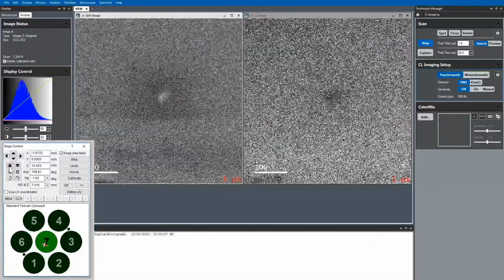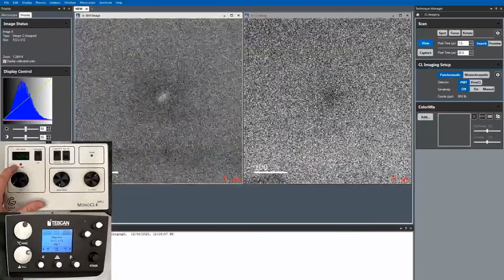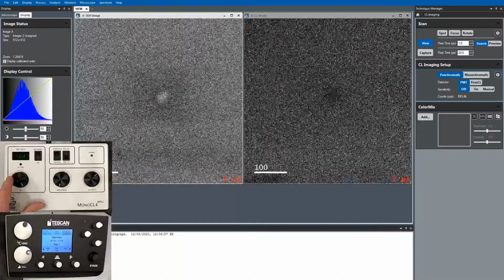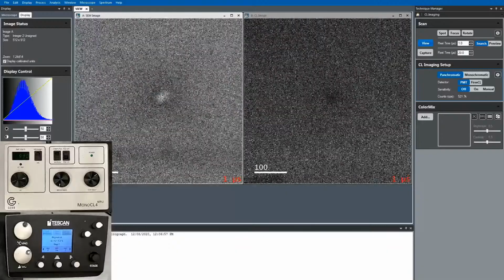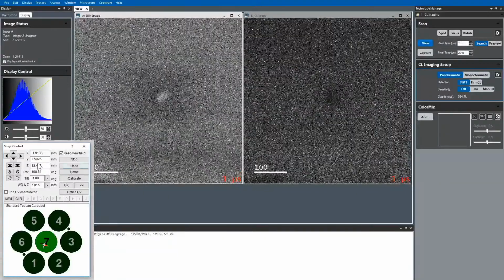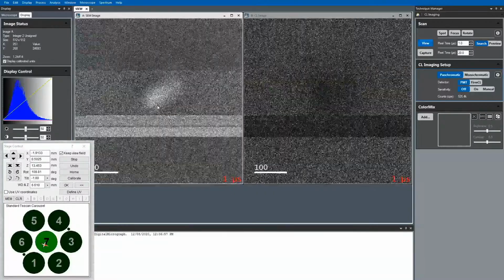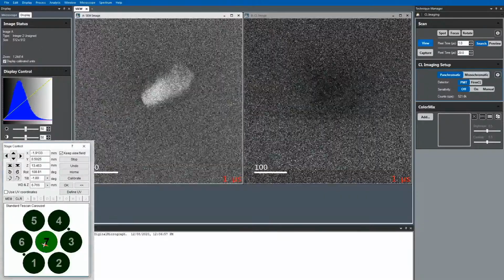And actually interesting, let me go back to the hand panel view. You can see the HT trip LED is flashing. So that tells us we need to turn this down. Photomultipliers are sensitive, and they have a lifetime. You can degrade that lifetime if you put too much signal on them. Okay, so let's tweak the focus, see about where we are. All right, so we're at about 6.7.